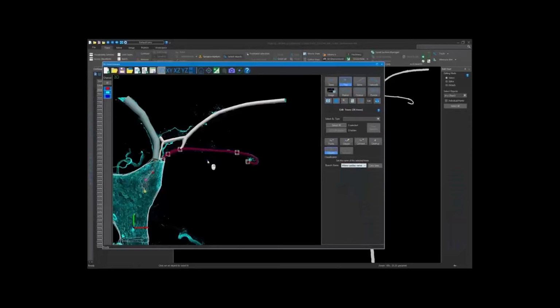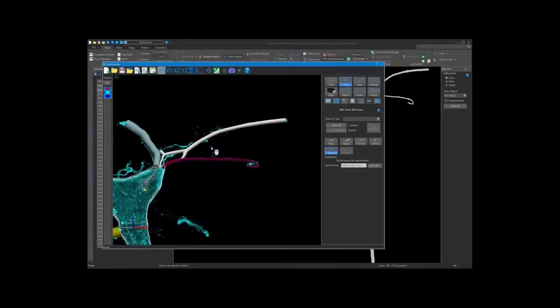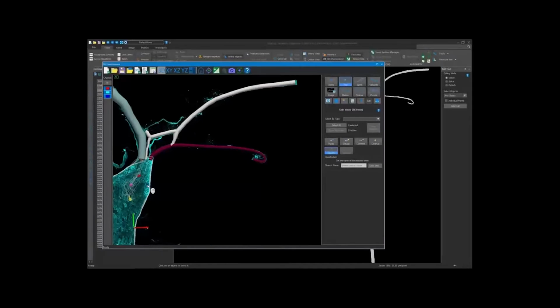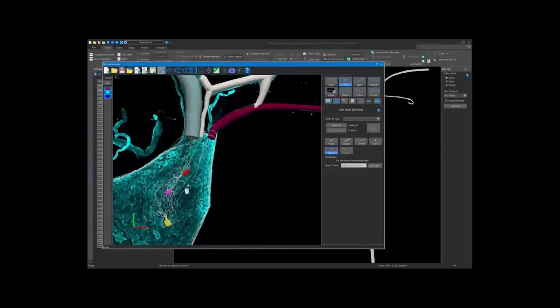And as I select inferior cardiac nerve, that selection turns the magenta color saying, yes, this is the inferior cardiac nerve. When I save this file, all the points that make up that segment that I've selected will be named inferior cardiac nerve, and they'll receive a persistent and unique identifier that maps back to the ontology. Could do the same thing for whole cells, dendrites, axons, bundles, however you're representing your anatomical structure that's in your sample.